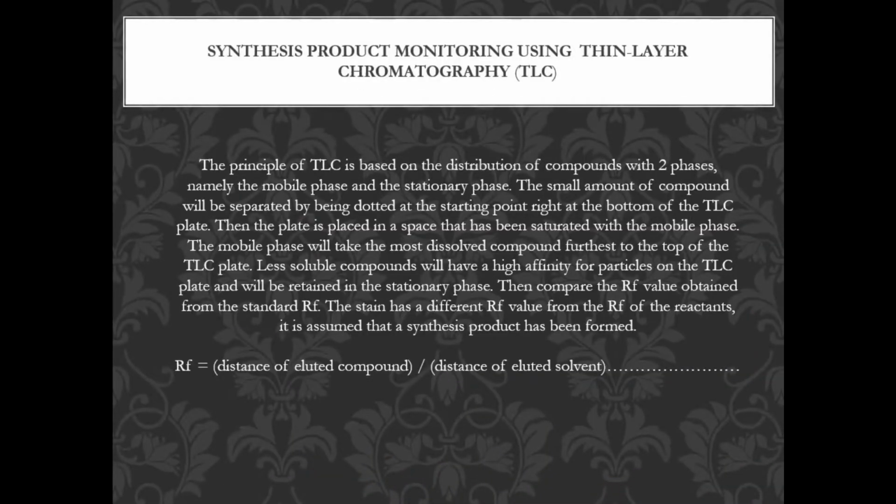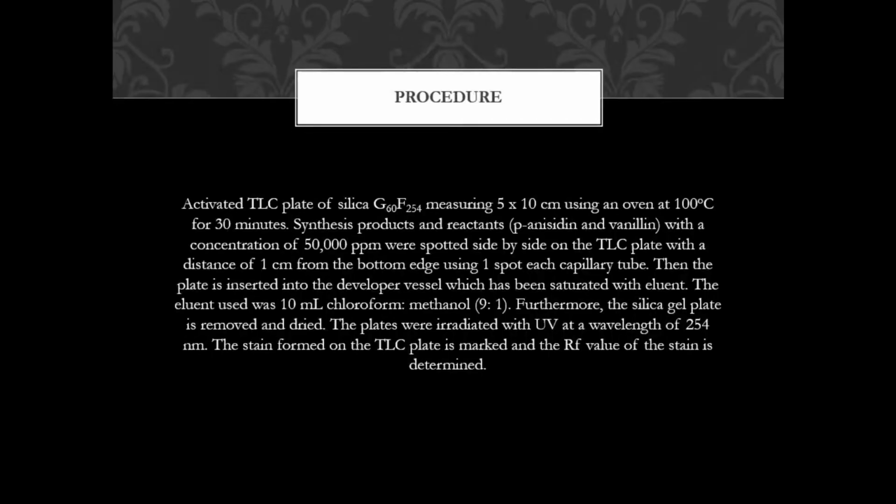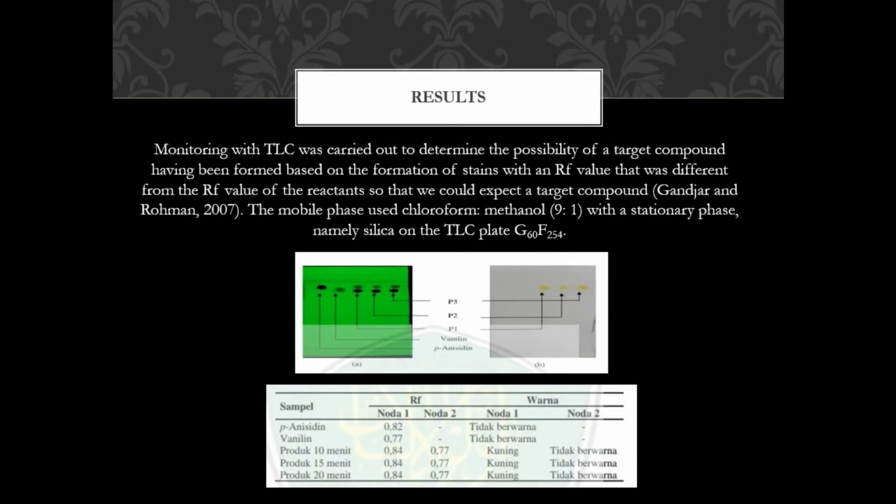My name is Andorisia. At this time, I will explain about synthesis product monitoring using thin layer chromatography or TLC. Monitoring with TLC was carried out to determine the possibility of a target compound having been formed, based on the formation of a stain with an Rf value that was different from the Rf value of the reactants, so that we could expect a target compound.